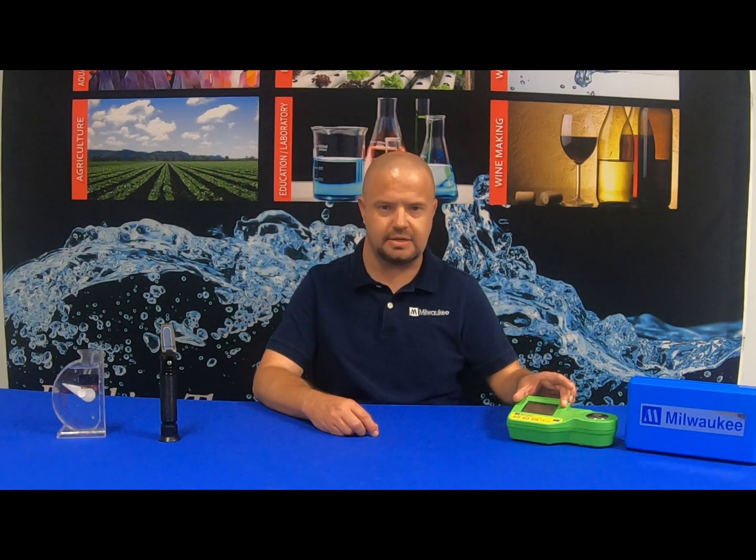With the Milwaukee Instruments MA-887 digital seawater refractometer, it's as simple as turning the unit on, applying your sample to the sample well, hitting the read button — which will then display on the LCD screen — and it also features automatic temperature compensation.